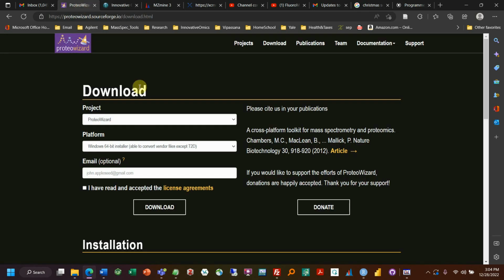So, the first thing we need is to download a few things. We'll need to download ProteoWizard, which you're going to need to convert your files. You'll also obviously want to do your own peak picking, so we'll leave that up to you because this assumes that you have your own peak picking algorithms. And you want to follow any of the tutorials in installing FluoroMatch Flow. They'll also talk about migrating your libraries that come with FluoroMatch Flow to your local libraries. So you want to do that as well. So look at that first tutorial for FluoroMatch 3.0.